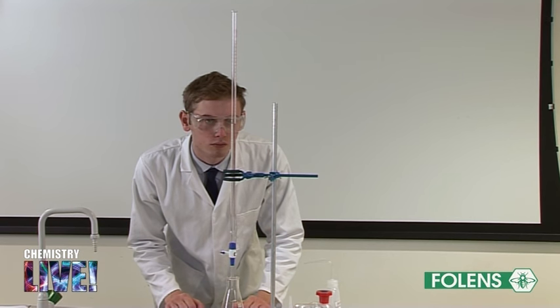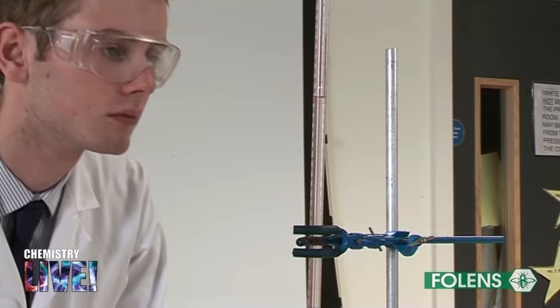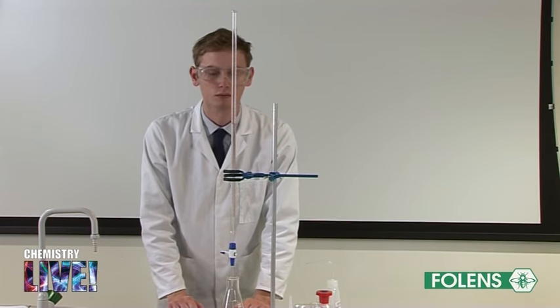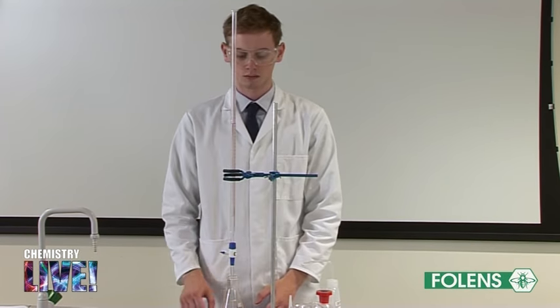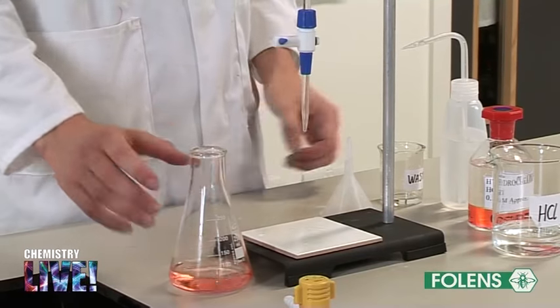In the final part of the experiment, you must now perform two further accurate titrations, adding the acid drop by drop as you come near the end point. First, bring the level of the hydrochloric acid back up to the zero mark in the burette.